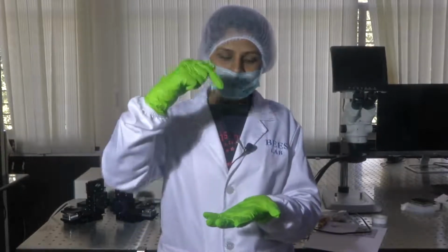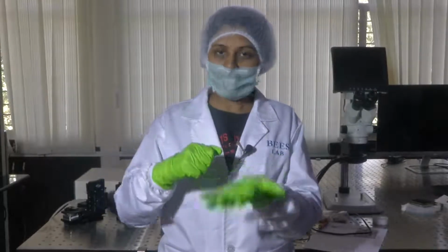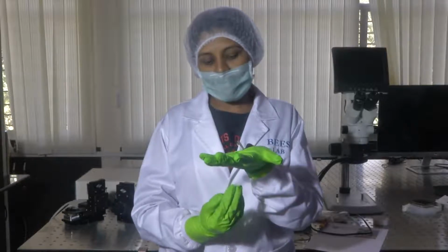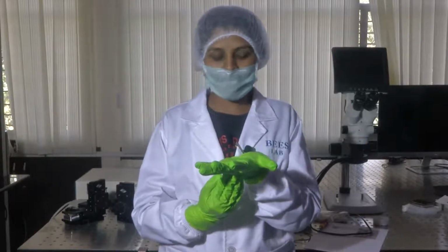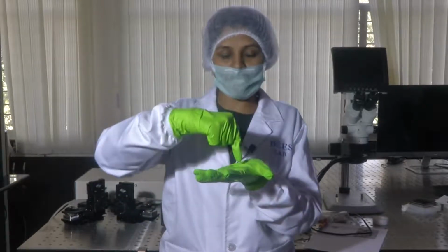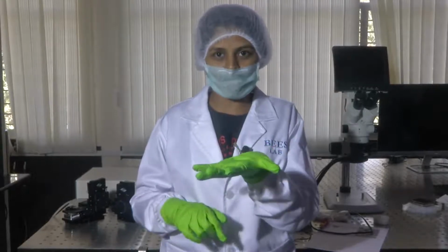OCT is a technology where light is dropped onto your sample, and then there is a mechanism where you indent the sample. Say at point T1 there is light which is shining on your sample, which is free of all external forces.